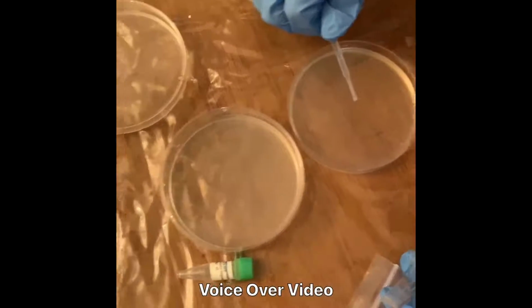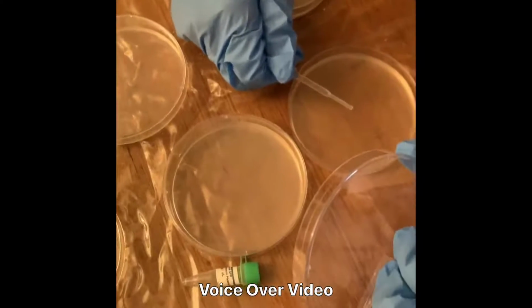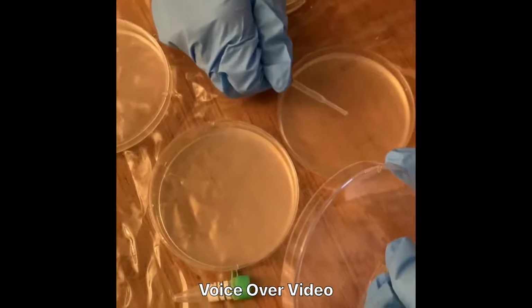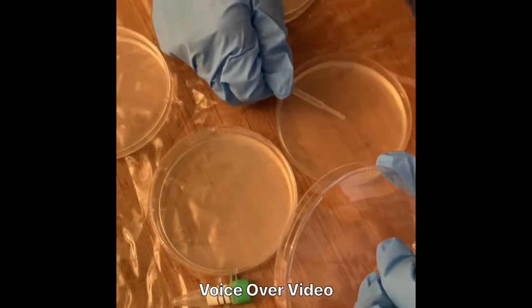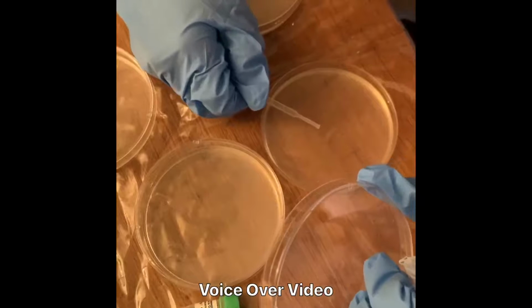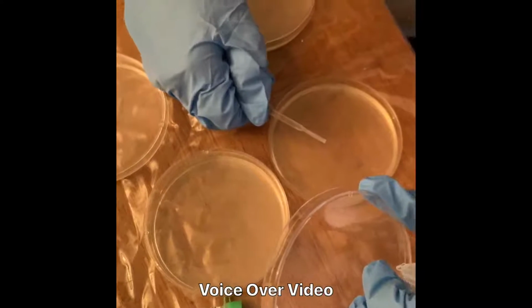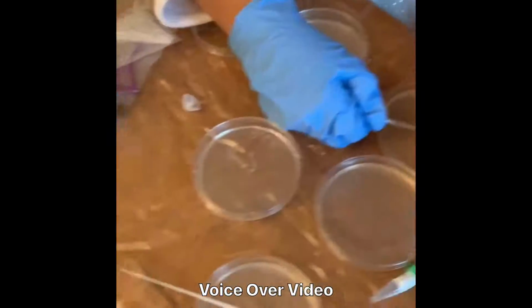And just drop it, a few drops, 4 to 5 drops on top of the agar plate. A 2, a 3, a 4, a 5. Oh, you did do 1. I didn't do a 1.